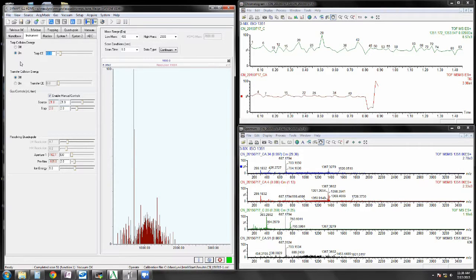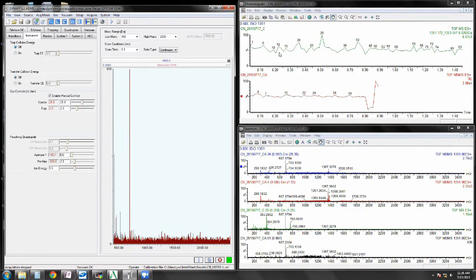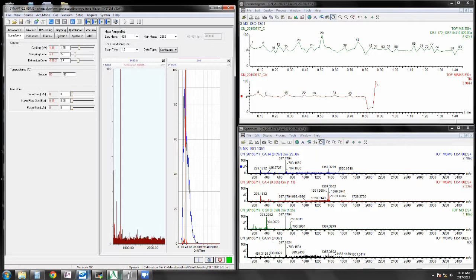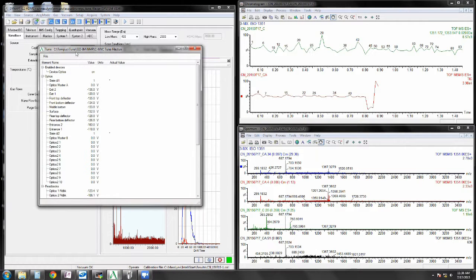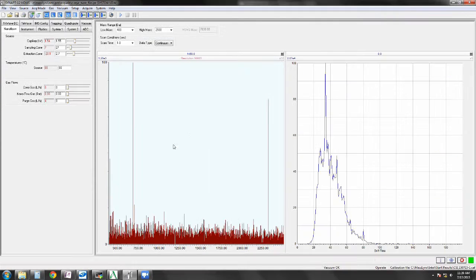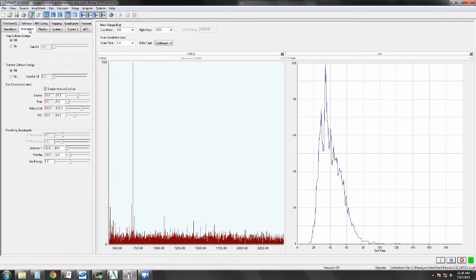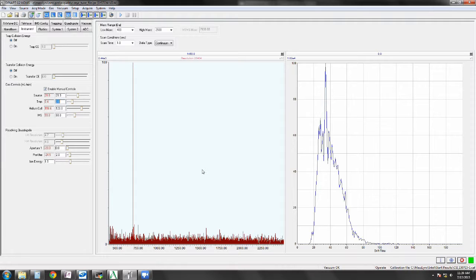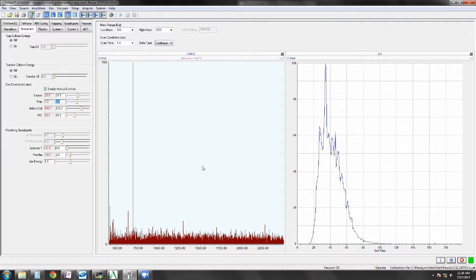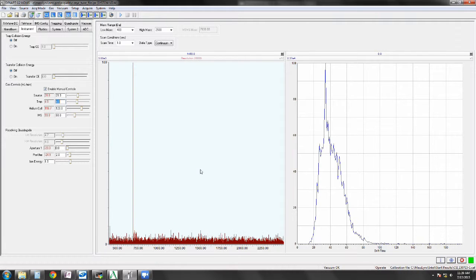The last experiment I'd like to show you is how to do a simple ion mobility experiment. On this instrument, this Synapt G2, we use traveling wave ion mobility. If you have the new Agilent instrument, you'll be using drift tube ion mobility. Ion mobility is useful for finding out the size and shape of molecules. It can be used to determine if modifications such as tags are having structural changes upon your protein. Looking at the spectra here, we see a slight change in the signal. As now we have the ion mobility cell, we're causing some fragmentation and we're only seeing the octamer species. This is commonly seen as the higher energy involved often breaks apart fragile species.